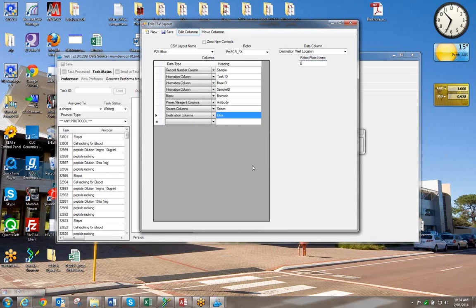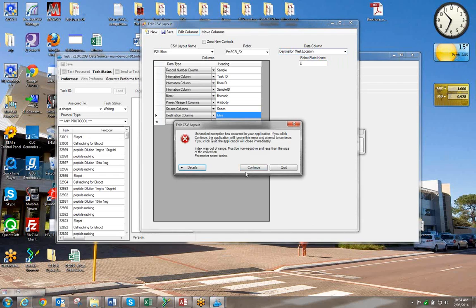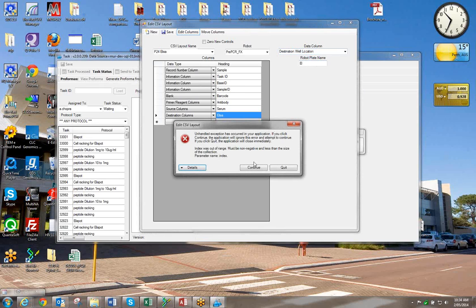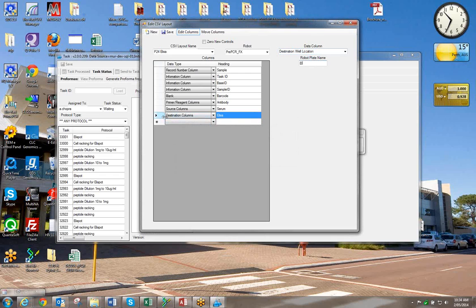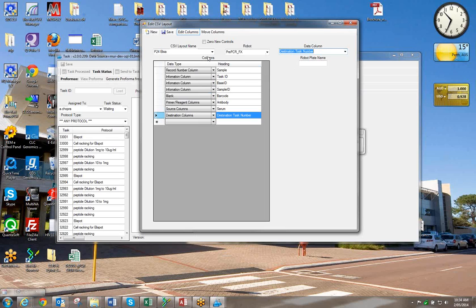Oh, what happened? It's hitting an error. And what you can go and do if this becomes confusing, just go to some reference CSV files and have a look at each one and see what it's given, and then it will go and do it.